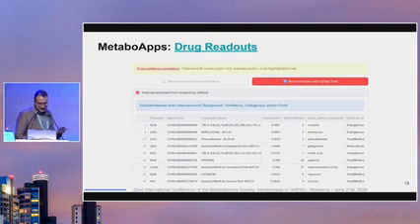So for example, in this case, as we're going to talk a little bit more about food readouts in a bit, which is our next tool, if you're looking for piperine or capsaicin based on some food, especially some peppers, you're not going to see any of those because that's just the default of the app, to not show them as related to any drug or exposure annotations. And you can also change that on the tables.